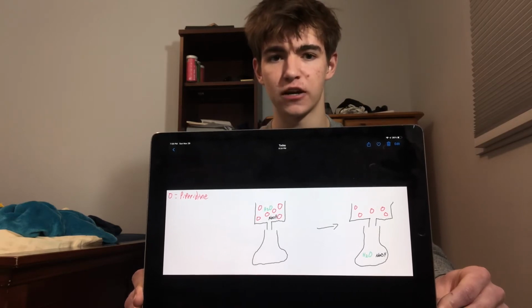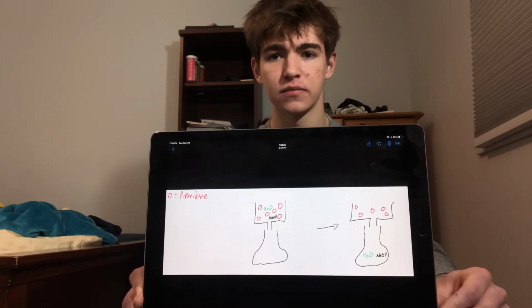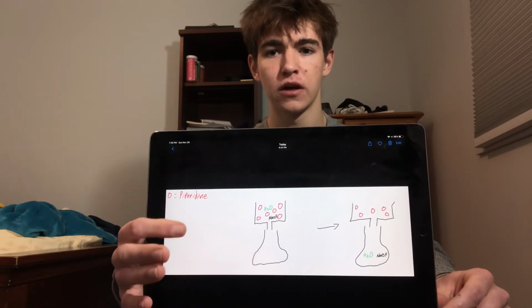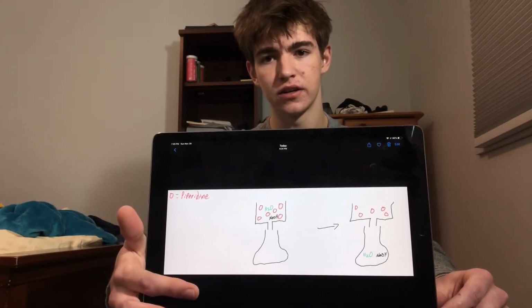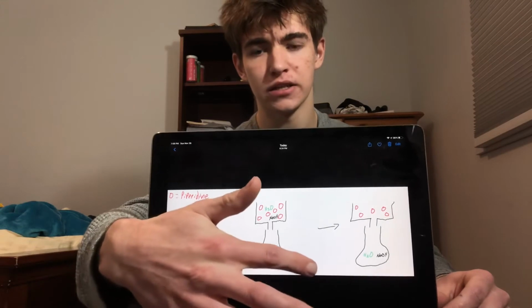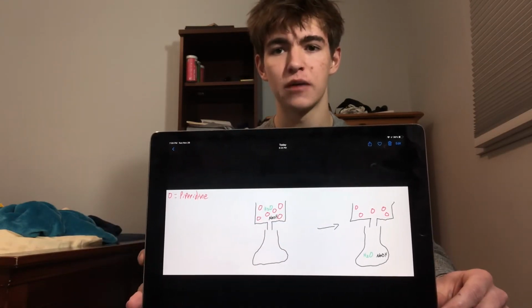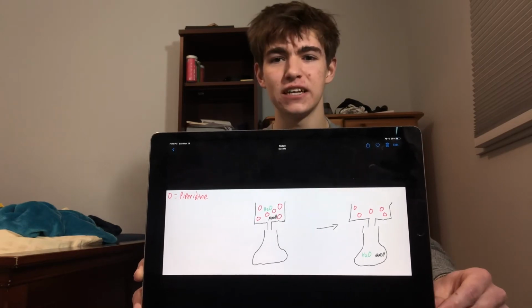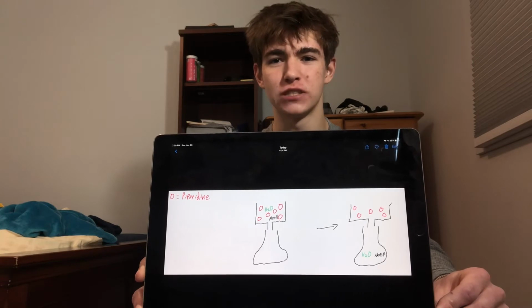To collect your final precipitate, you want to use suction filtration by using a Buchner funnel, which will remove the water and the base and will isolate your final product, piperidine, as shown here in the model. All the impurities that you do not want get sucked into the chamber right here, and now you're left with your final product, piperidine. We have an isolated piperidine, anthracene, and oxalic acid from a homogeneous mixture.